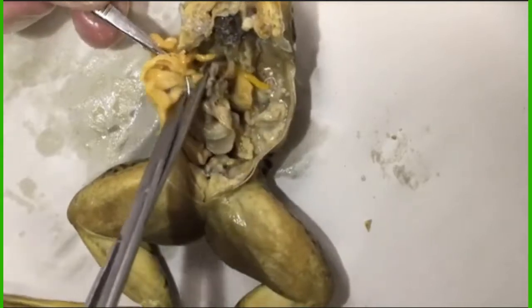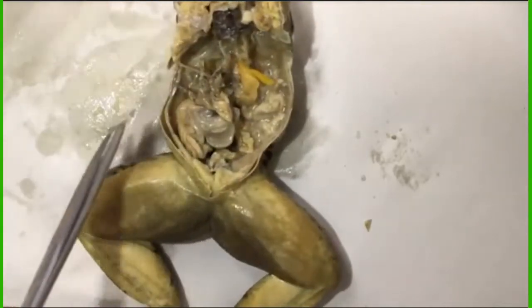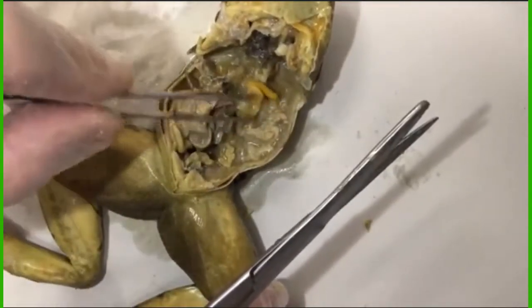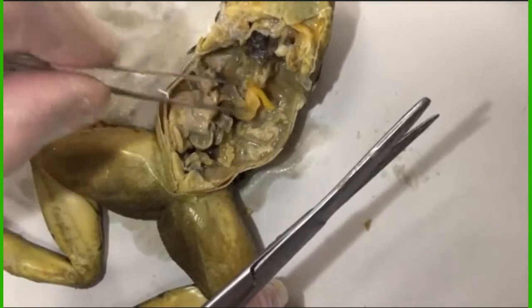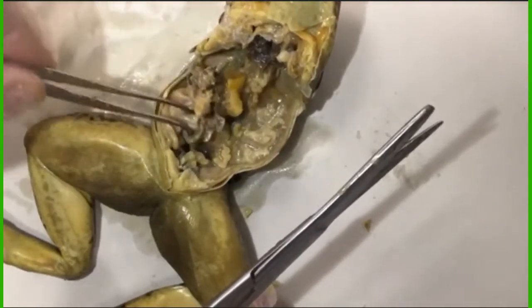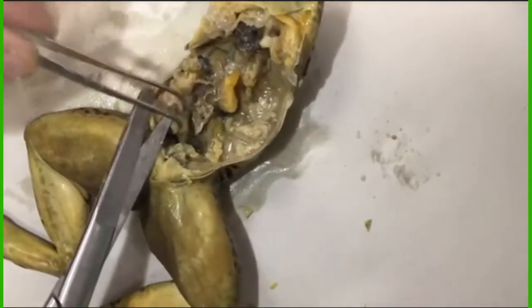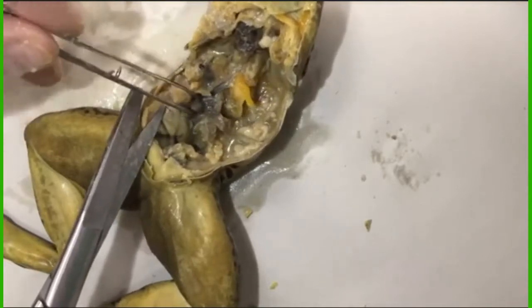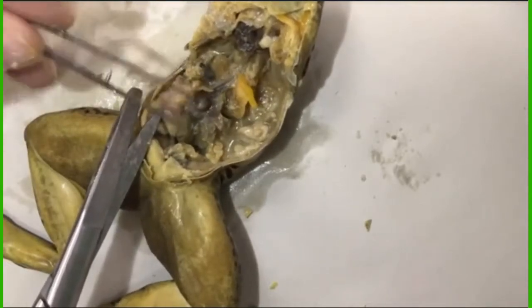But the fat bodies are fat storage for energy, just like we store fat for energy. The difference is the frog only has it in those places. They don't have it spread out throughout their body. But they do use it for energy store when there's leaner times. There's a gallbladder right there. I'm sorry, not gallbladder, spleen.